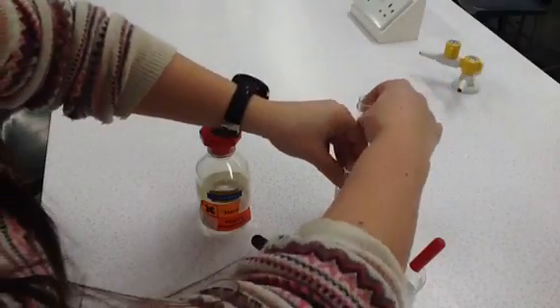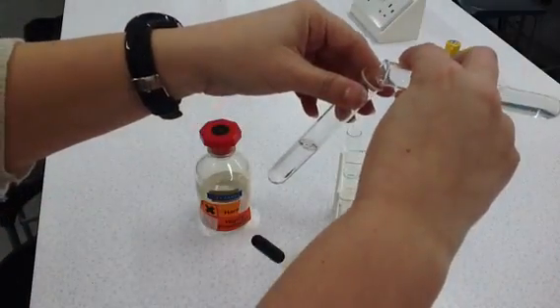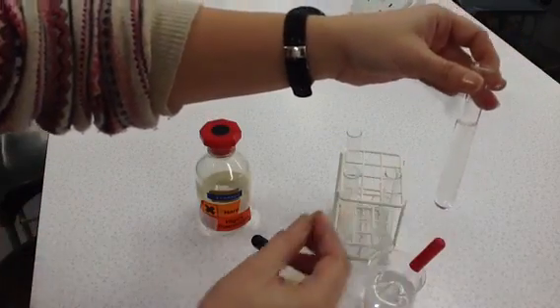So if we do the same with tube B and observe the tube, it hasn't turned into that milky emulsion colour.